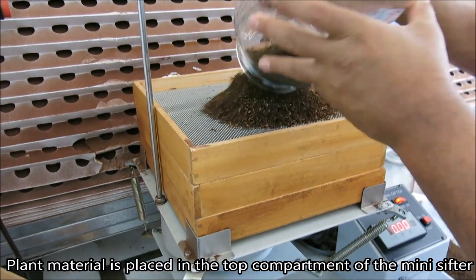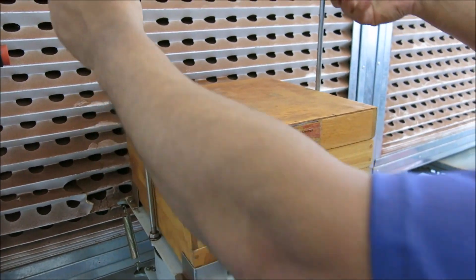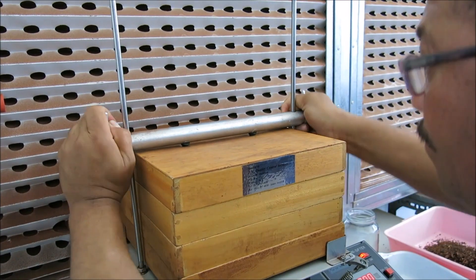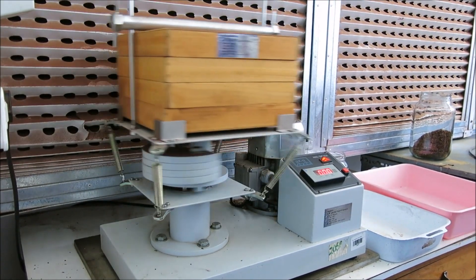The dried tea is sieved to remove coarse pieces of stem and leaf, as well as very fine material, to obtain the tea bag fraction. This fraction will be used to prepare the tea for evaluation of its sensory quality.